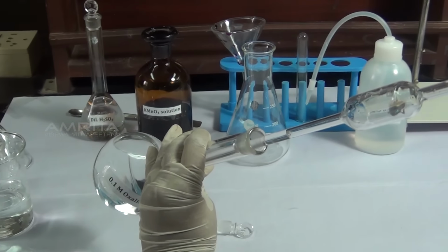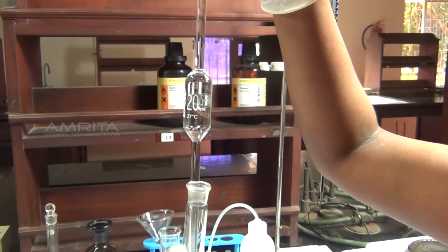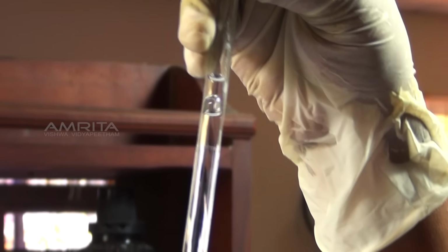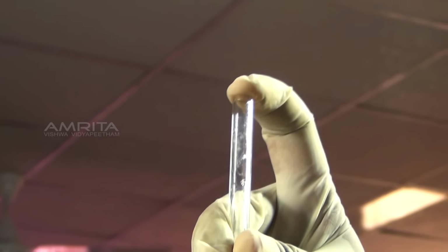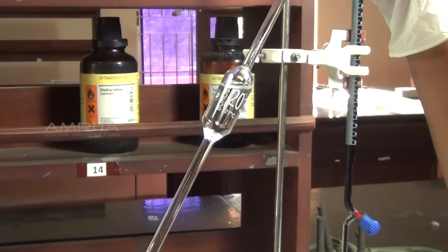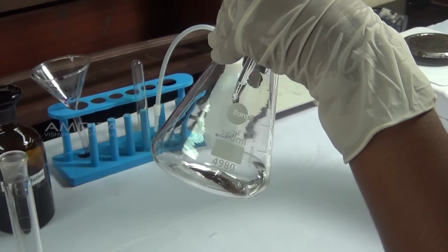Now pipette out the oxalic acid solution from the standard flask until the solution level is just above the calibration mark on the pipette. Close the upper end of the pipette with the index finger. Slowly release the finger so that the solution is allowed to run slowly until the lower edge of the meniscus just touches the mark on the pipette, so that the volume of the solution becomes 20 ml. Carefully transfer the 20 ml oxalic acid solution into the clean conical flask.